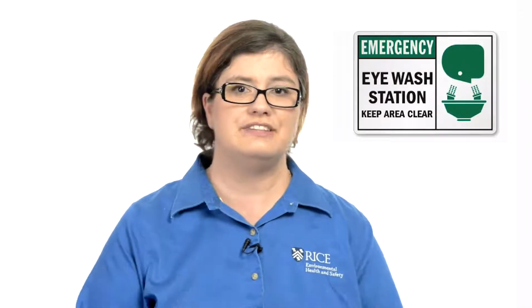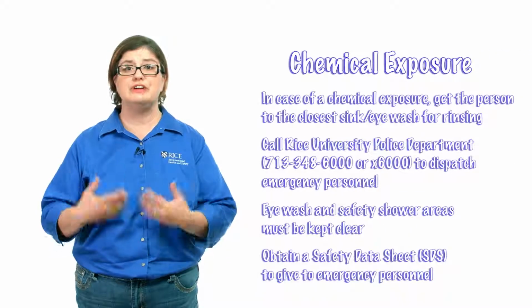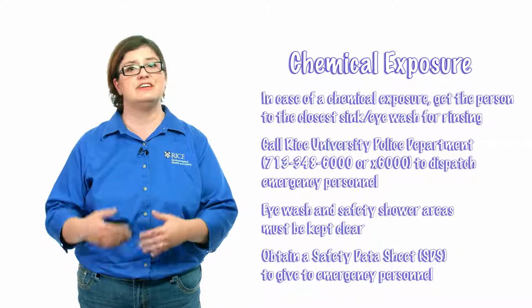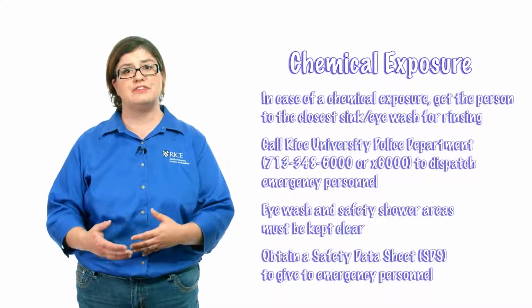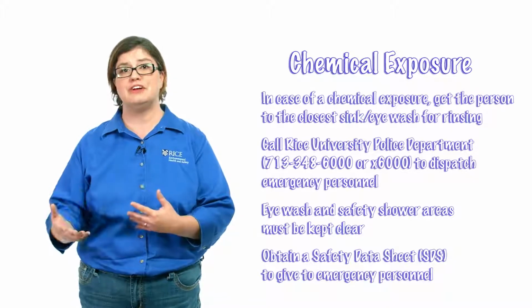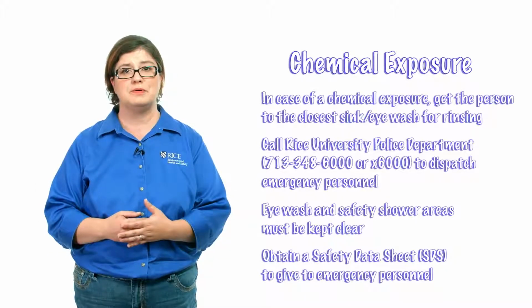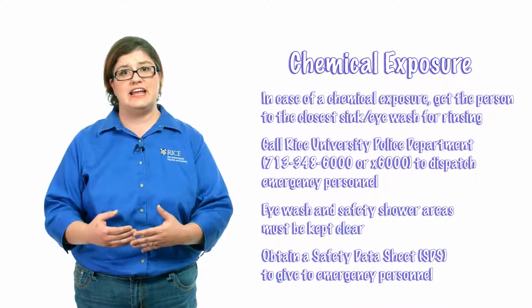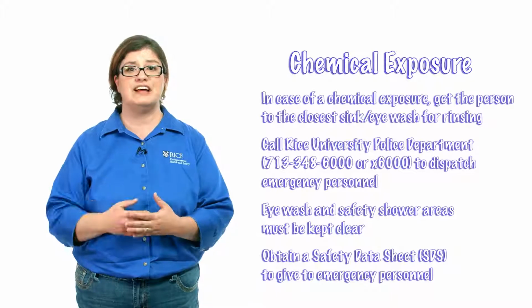In cases of chemical exposure, you definitely want to get the person to the nearest sink or eye wash station. Give their eyes or affected body part a good rinsing. Rinse, rinse, rinse until emergency medical help arrives. Definitely call Rice University Police Department and let them know that there has been an emergency, and they will dispatch emergency medical help. Please obtain a safety data sheet on the material to give to the emergency personnel.